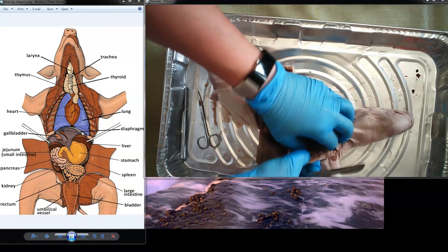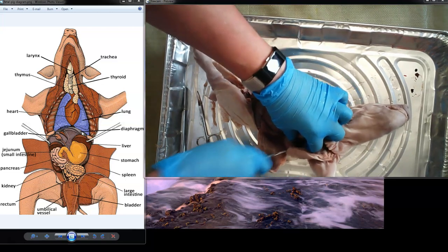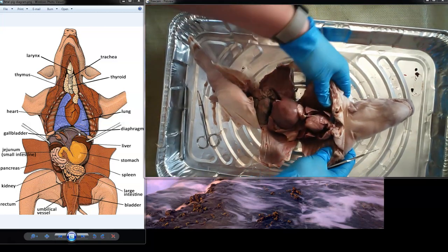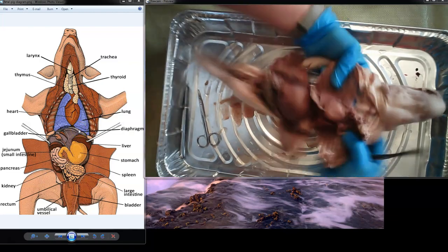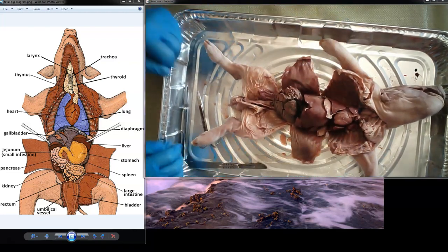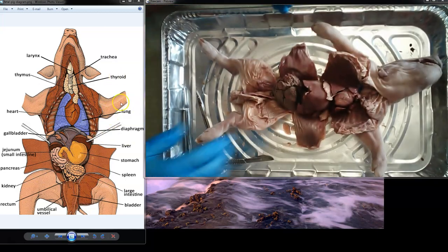Okay, so I have now 2 questions. All right, let's get the oldest question first. Okay, I was going to... Sorry? Put the cursor on everything that you're talking about. Sure, yeah, no problem. I was going to call it an Elio. Oh, I see the blue vein better this time. Yeah. All right, there we go. Okay, so are we good?